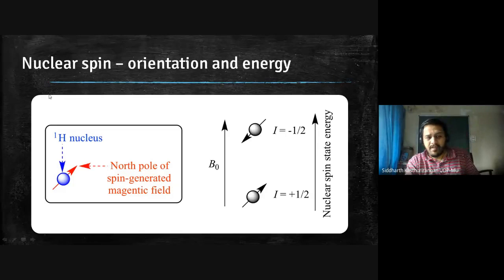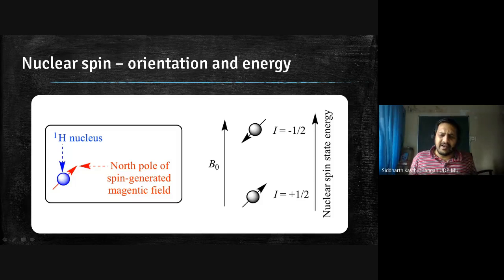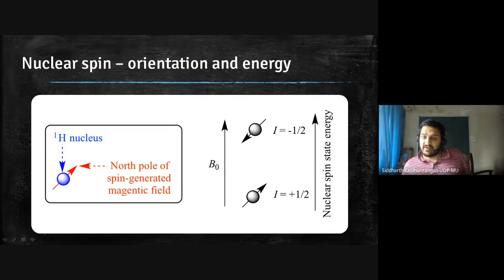is very simple. The idea is that we have a nucleus, and it has a spin. Especially, consider a proton for example, because most compounds, especially organic compounds, are where NMR is more dominantly used. It is also used for semiconductors and other things, but dominantly for organic compounds. Organic compound is a very wide branch: you have paints, dyes, polymers, oils, so many different types of materials, and pharmaceuticals, which need this kind of analysis. Okay.